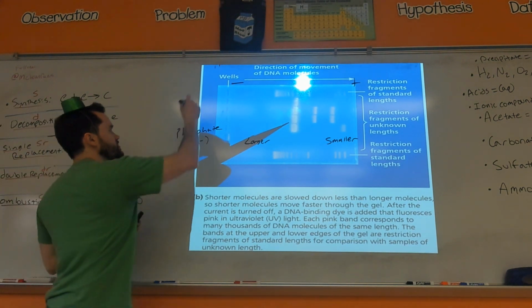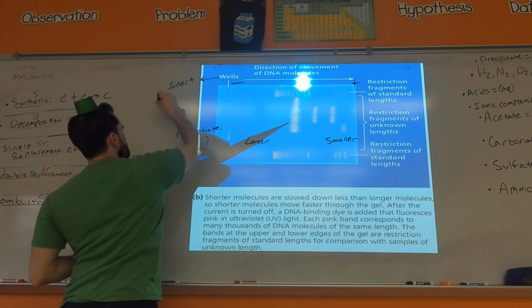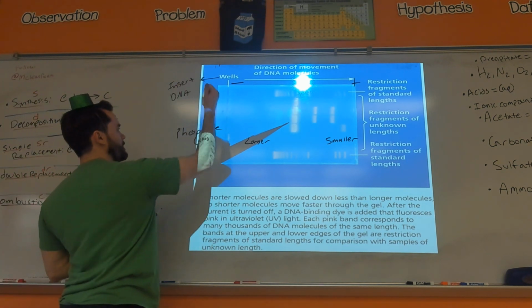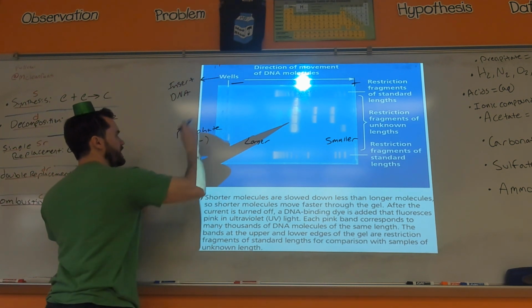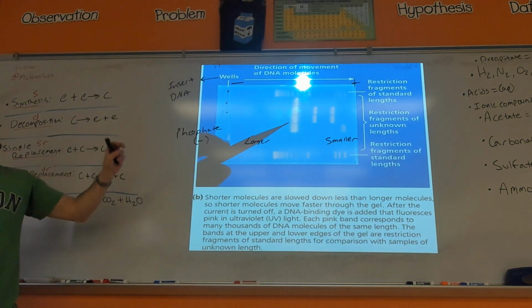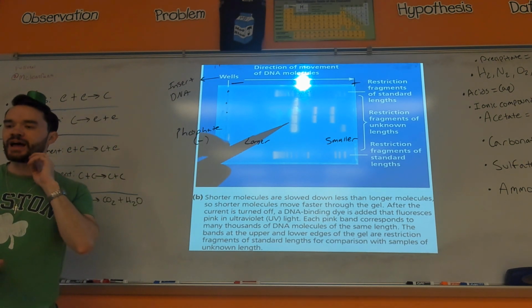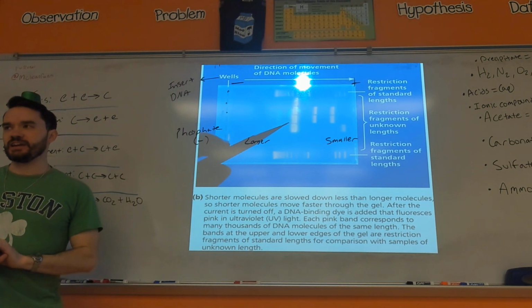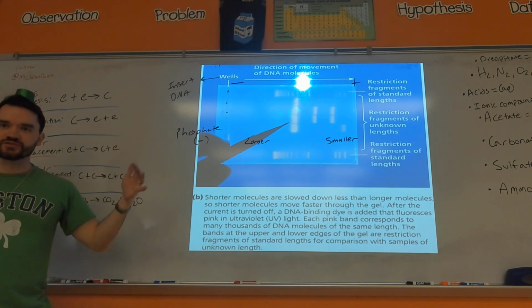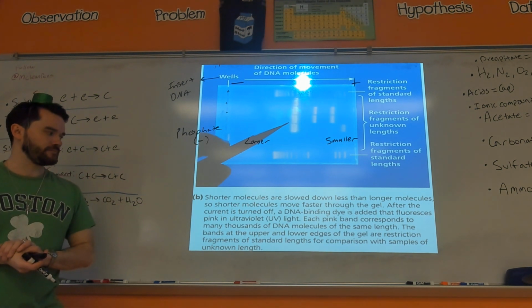Wells, these are where you insert the DNA. So basically wells are these holes in the gel where you'll have a pipette and you'll insert your DNA sample, in however many wells of DNA samples you have. Usually our gels have 8 wells, so you could run 8 different samples of DNA. But I suppose you could have bigger gels where you could test more than 8 different samples.